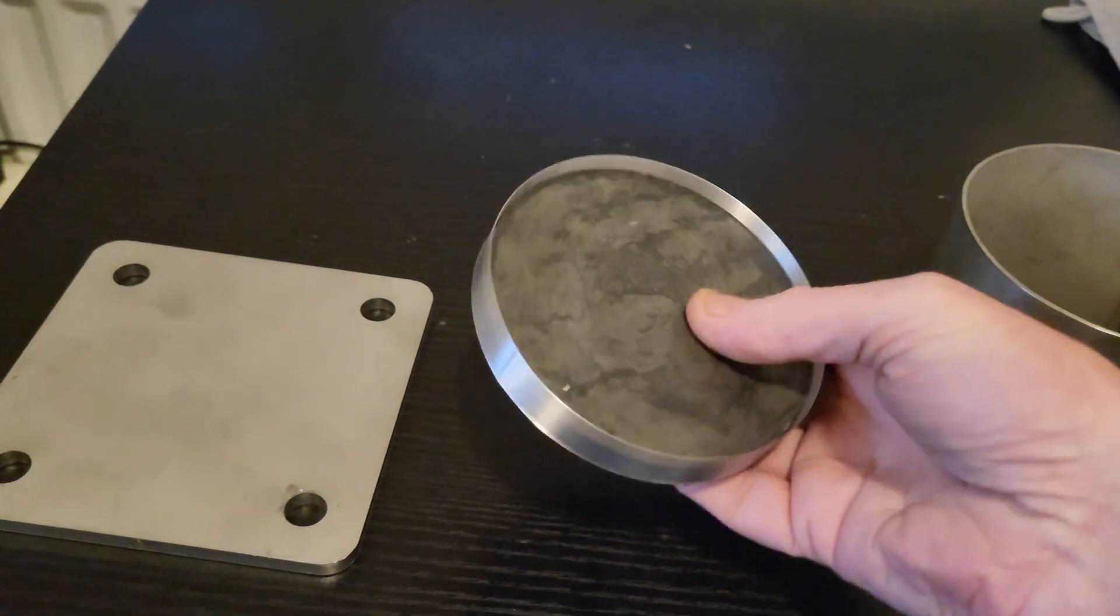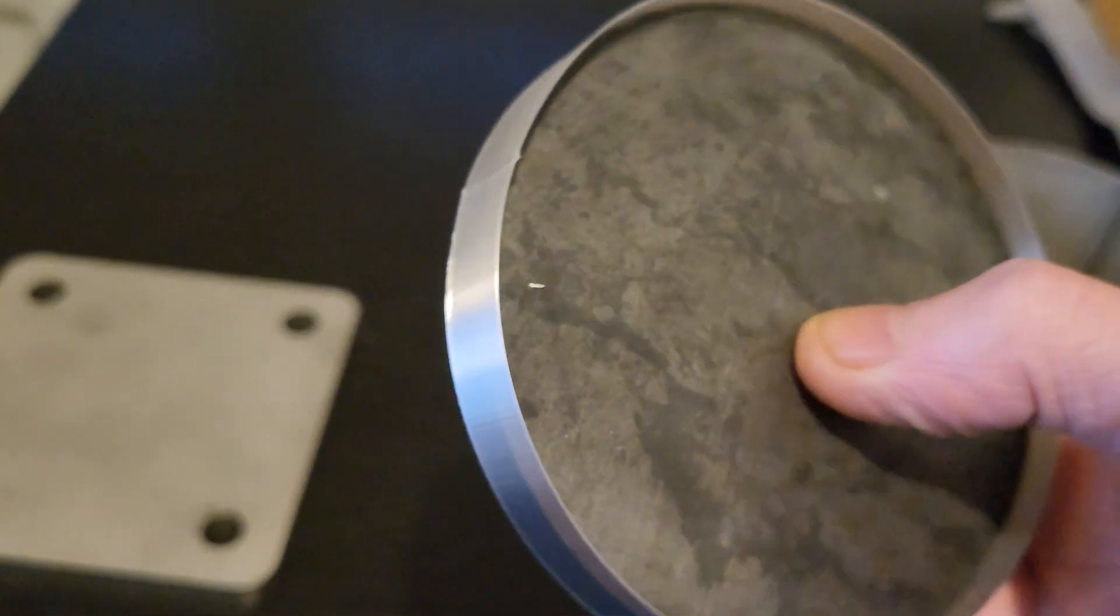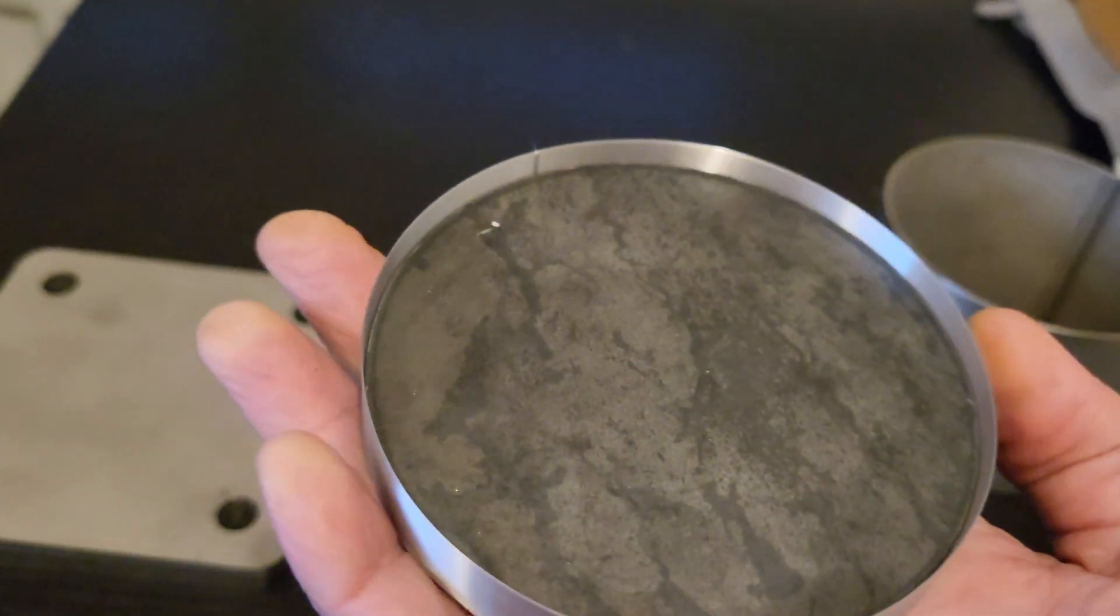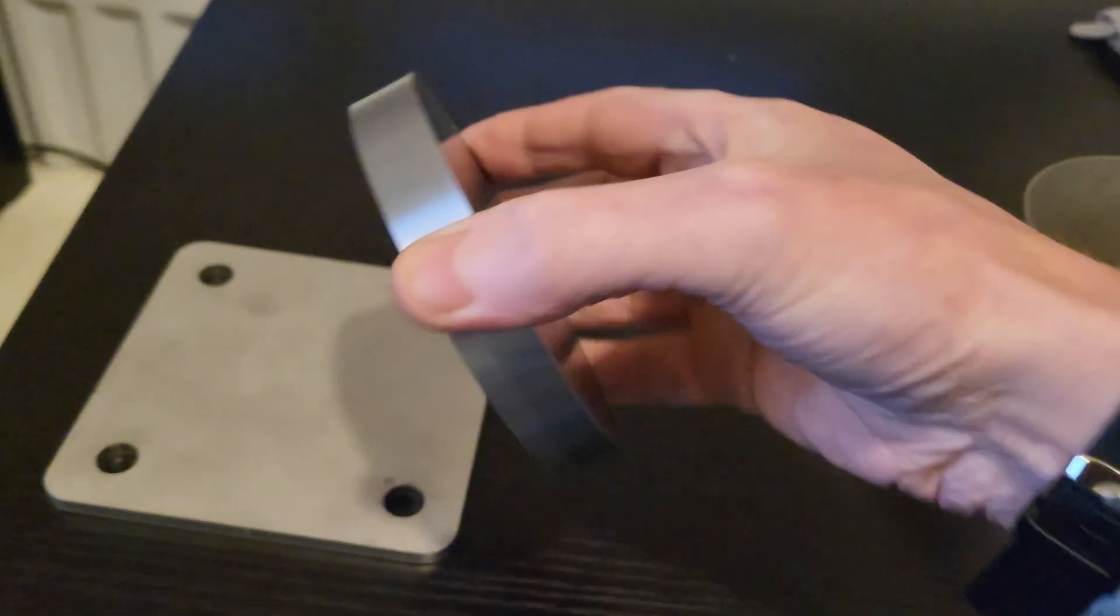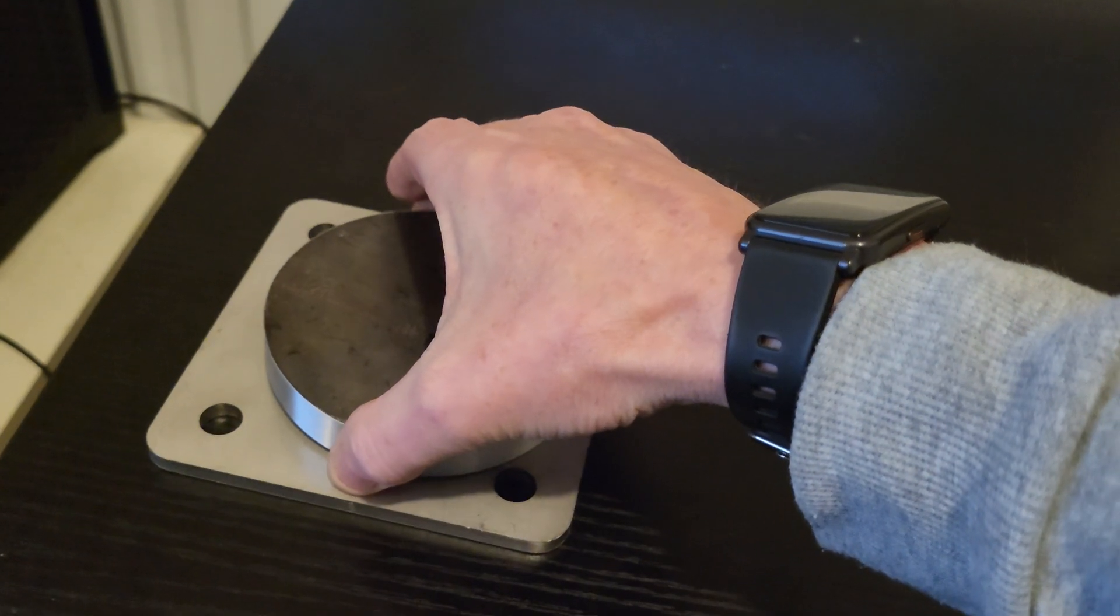And then this, another steel plate with a 3D printed ring around it to contain the powder, will be placed on top.